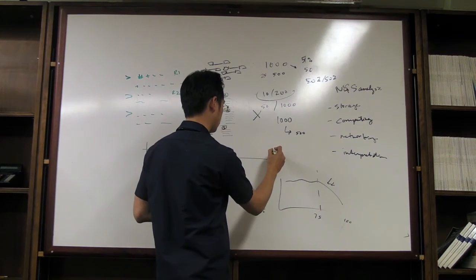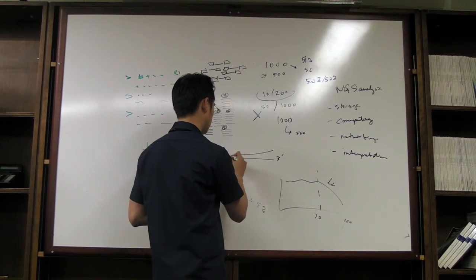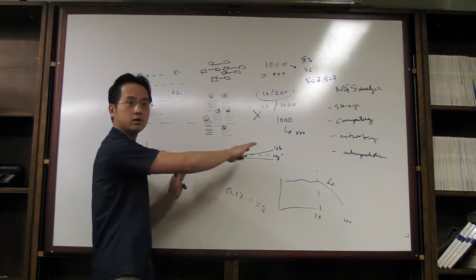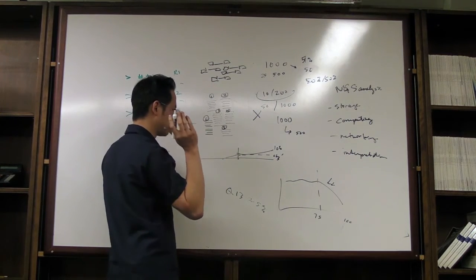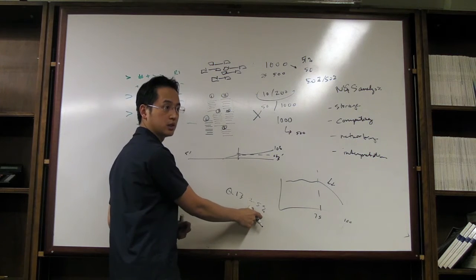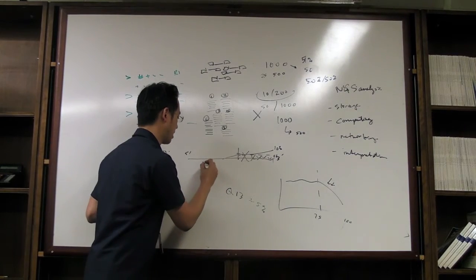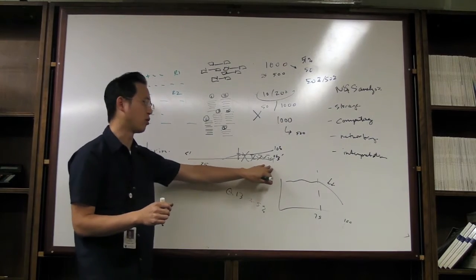So I'm going to draw the error rate, okay? Let's say that's 5% and this is 10%. As I go further along the line, I have very erroneous bases here. So what I'm going to tell the computer to do is take all my sequences, find out where it starts becoming 5% or more erroneous, and basically just trash the ends. So trim it, cut it away from me. So now I'll end up with just 75 bases that I'll deal with. I'm still happy with the 75 bases. Because it's not worth mapping this.